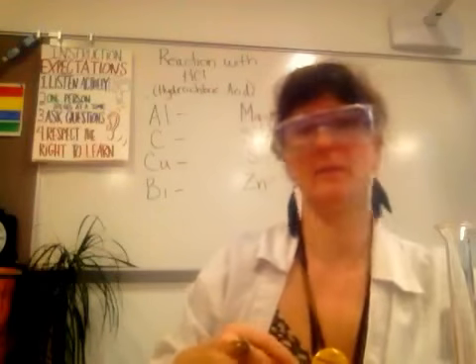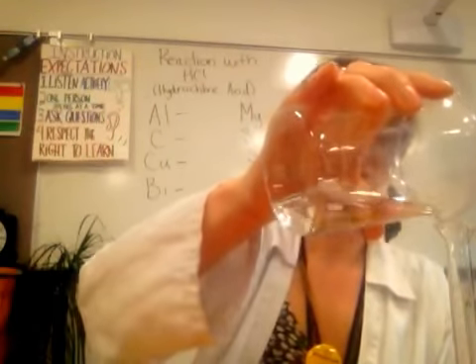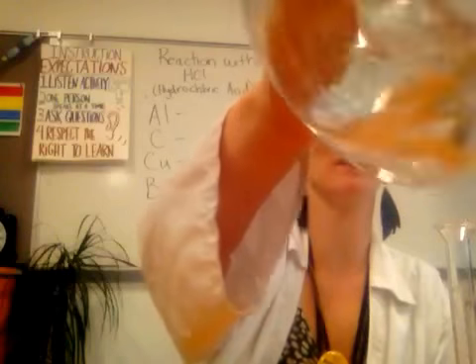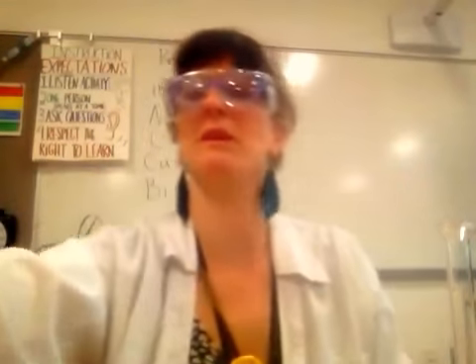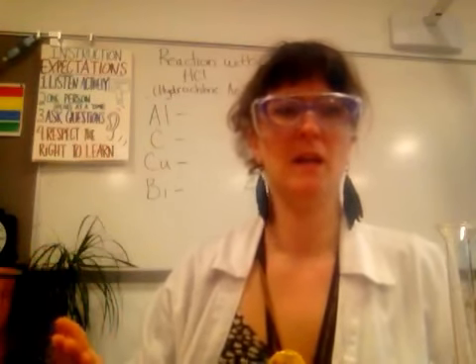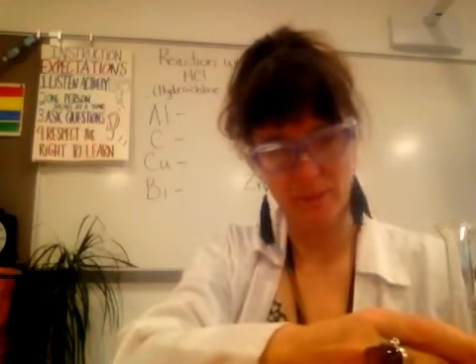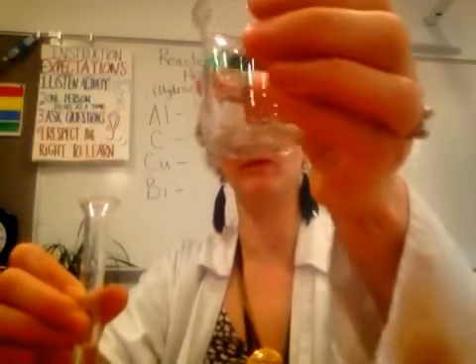I'm going to add a little bit more hydrochloric acid to each of my graduated cylinders. As a reminder of what it means to have a chemical reaction, evidence of a chemical reaction would be bubble formation, a color change, any of those things where you see something happening in the beaker or in the test tube. So this one I'm a little bit less than 6 milliliters, but it's okay. We'll be able to hopefully see something.